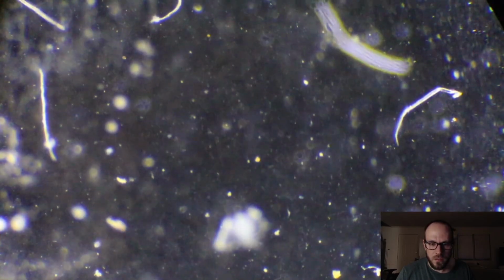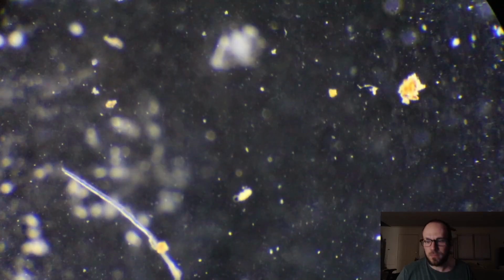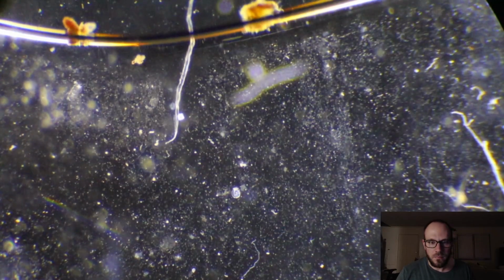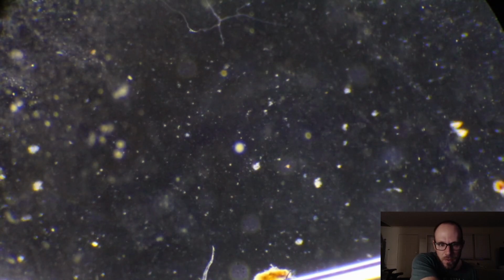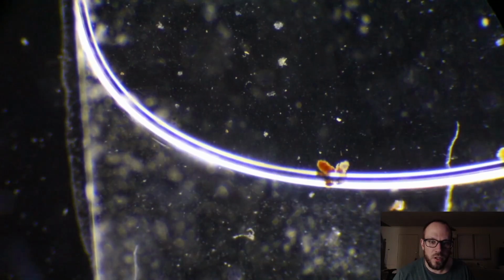Garbage. Wait, did I see something move? Nope. Nope. Nope. See, that looks like it's supposed to be green. It might be a bit of a lichen or something, but no, it's not. It's just some kind of aberration of the light. Too bad. So sad.